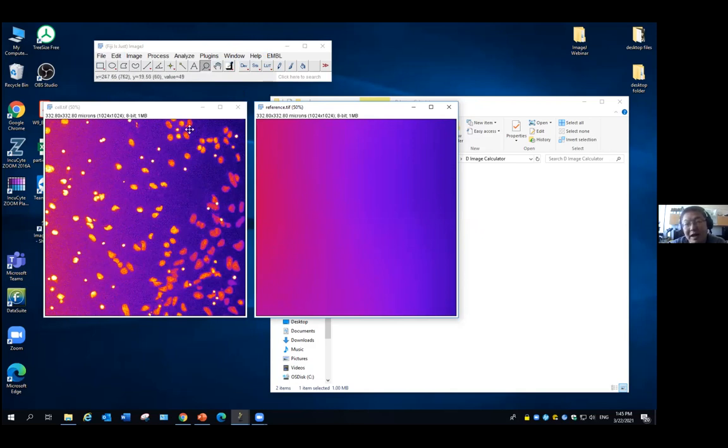So we're going to use this one to normalize this. We'll do a divide: this one divided by this. Here is stronger, but here is also stronger, so when you divide, it will be similar to the weaker signal divided by the weaker signal. But dividing is not that simple. You cannot directly divide here. If both images are 8-bit, then all the signal becomes very small.